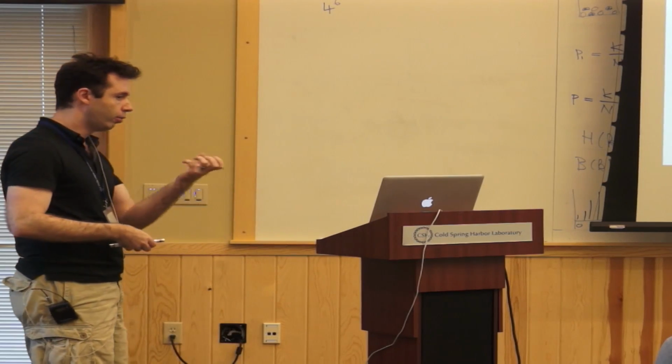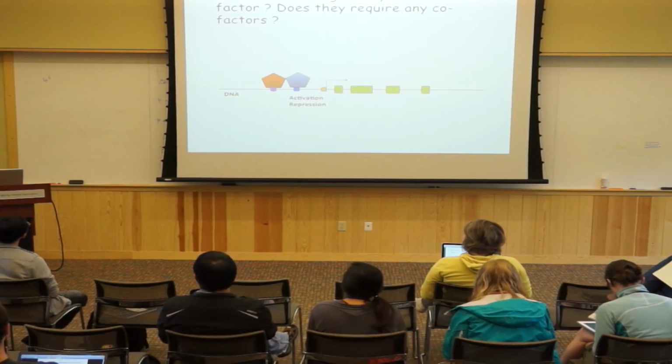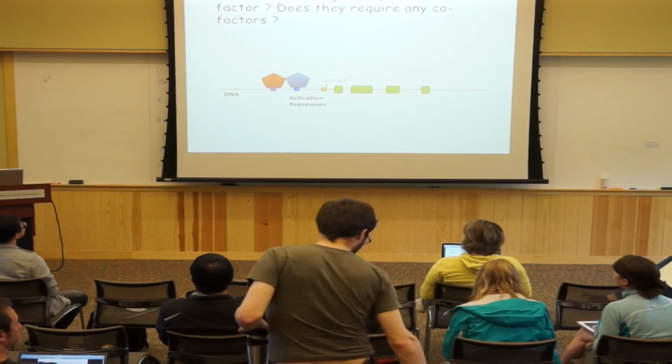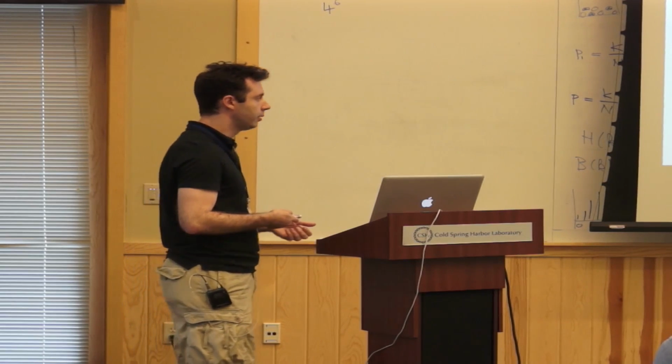When you look at the sequence of the peaks, you might be able to detect the presence of these cofactors just through a DNA motif analysis. DNA motif analysis, in addition to the QC step that I mentioned, is very important when it comes to ChIP-seq.